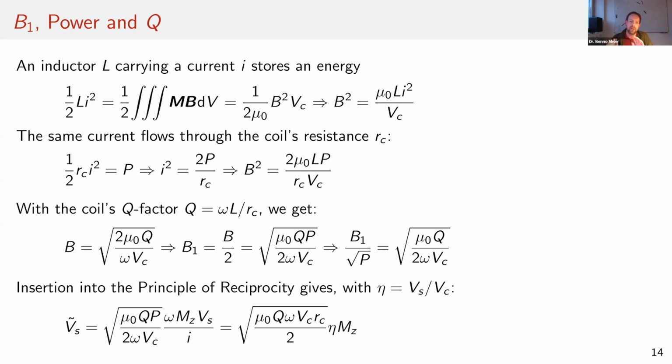But sometimes you may have a larger coil. That would be the case also if you have a cryoprobe, where the coil becomes a bit larger, and so the filling factor would go down a bit. Okay, so that's the signal.